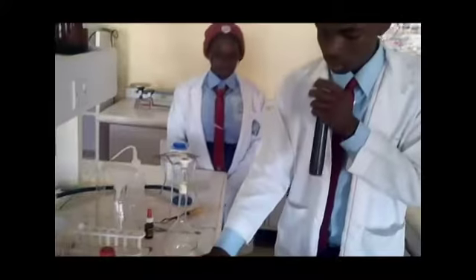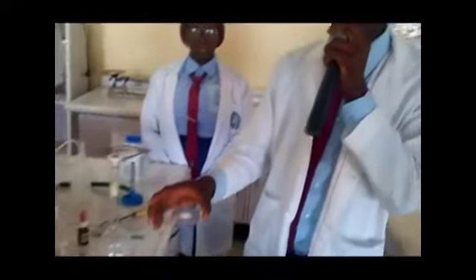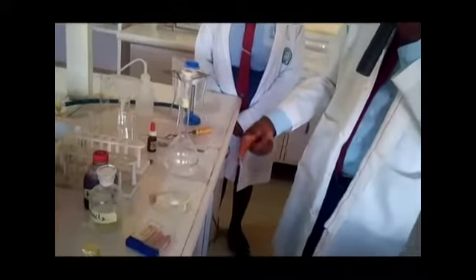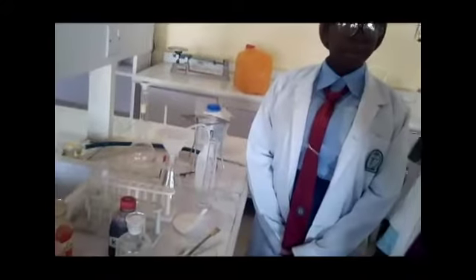It is important to know that a sample may be subjected to preliminary tests. Some of these tests include heating the sample, testing the sample with litmus paper, and determining the solubility of the sample in water. Now we may be asked to determine the solubility of our sample in water.